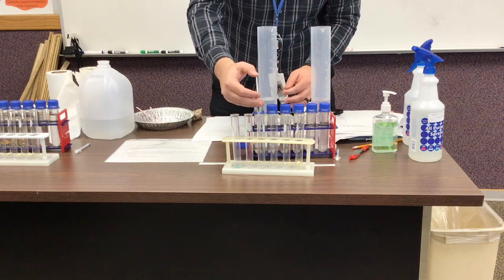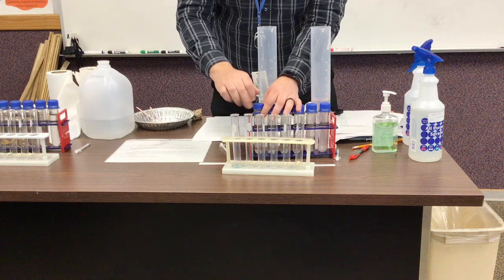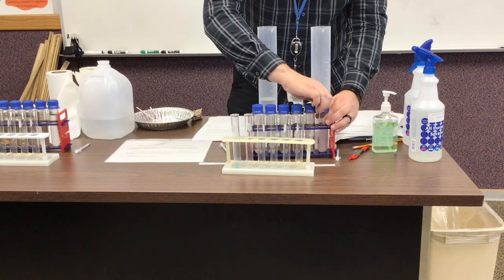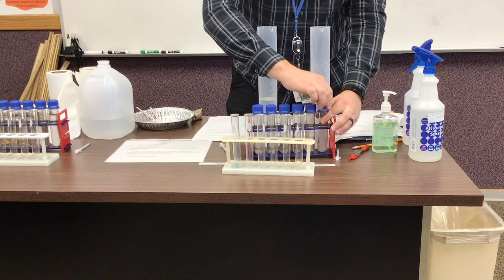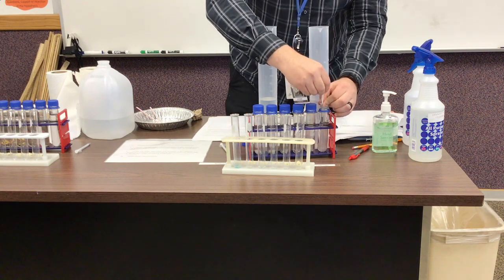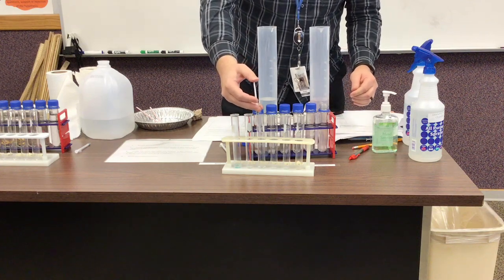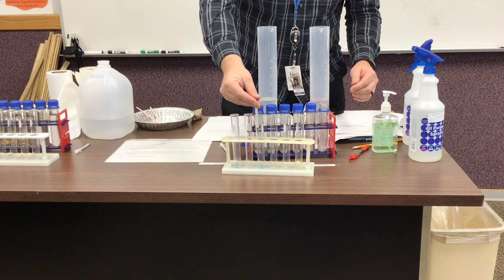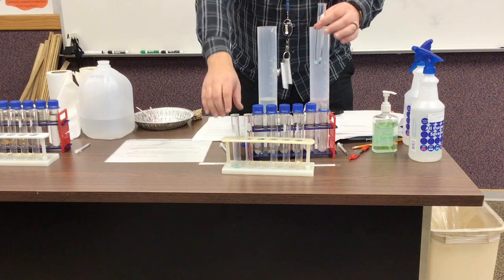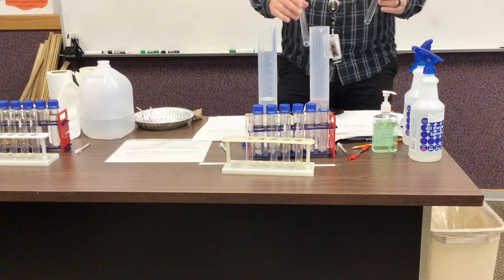Then we're going to take some of the copper nitrate and put that in the same test tube, and we can see the change happen as I added it there — hopefully you could see it pretty clearly.